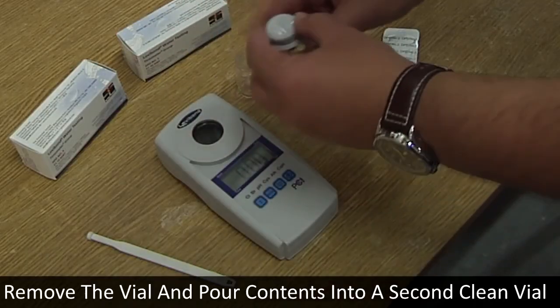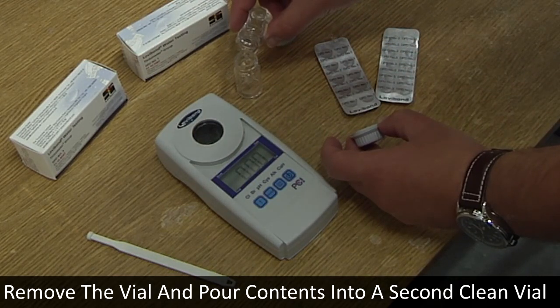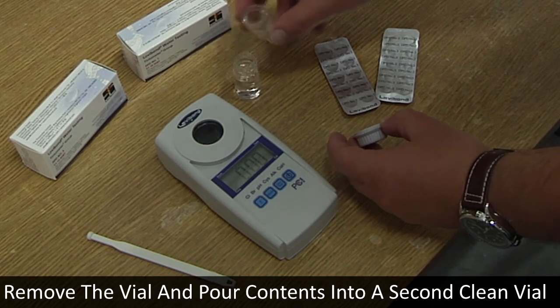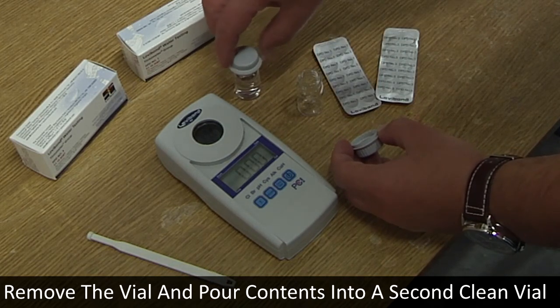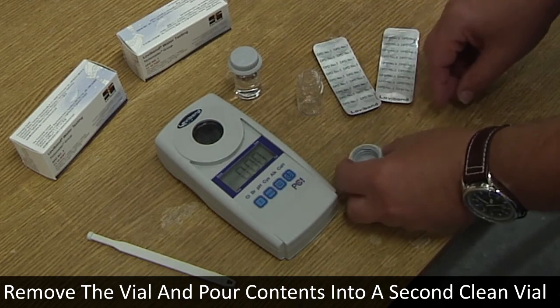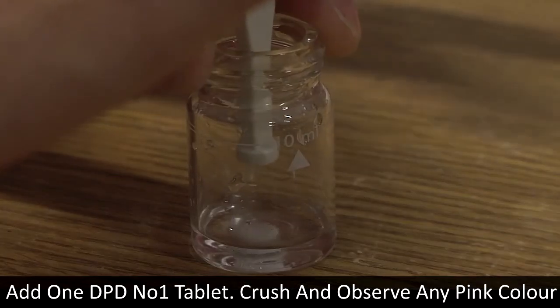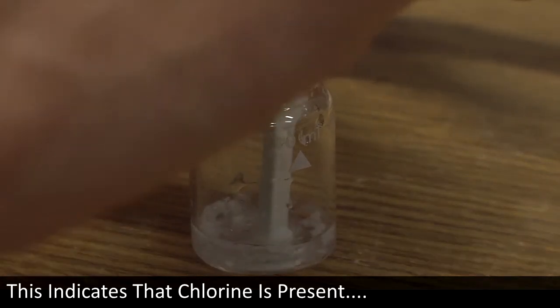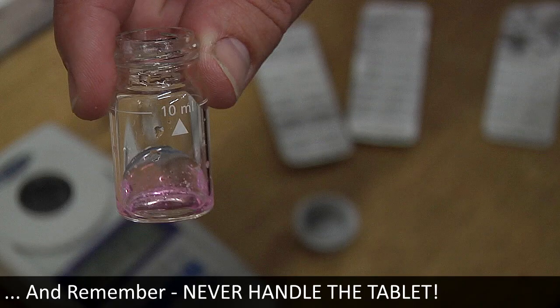Remove the vial and pour the contents into a second clean dry vial, leaving a few drops in the original vial. This part of the procedure is recommended only when performing a free chlorine test, due to the possibility of colour bleaching at high levels. Add one DPD number one tablet to the original vial, crush and observe any pink colour — this indicates chlorine is present. Remember, never handle the tablet.